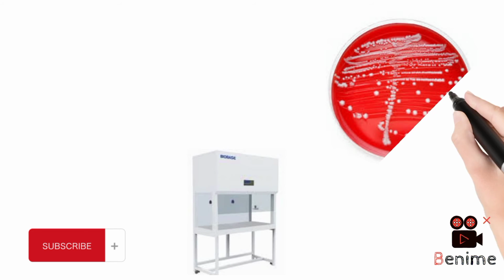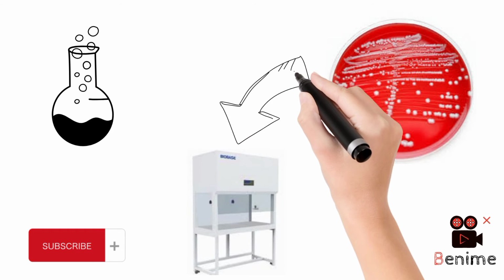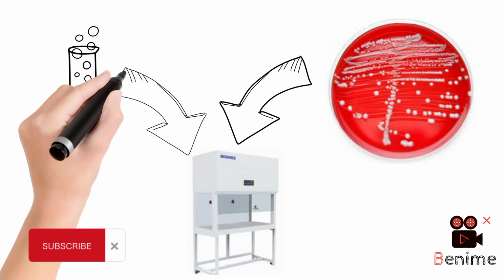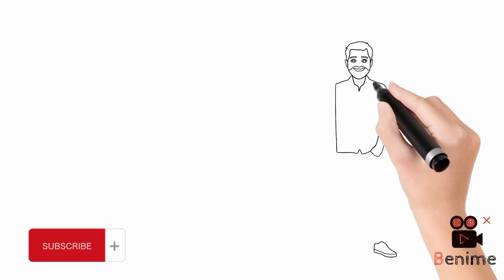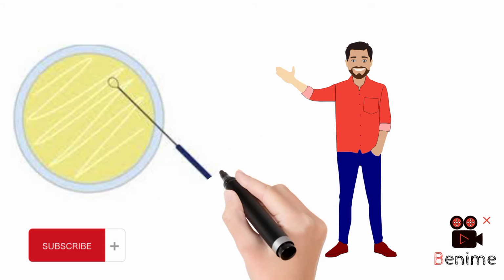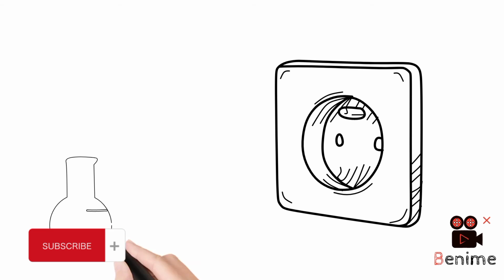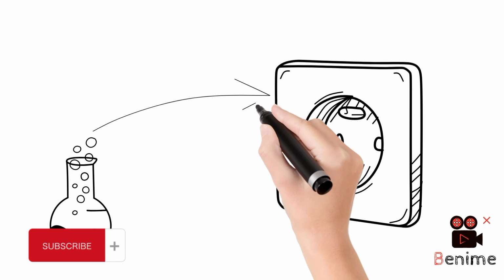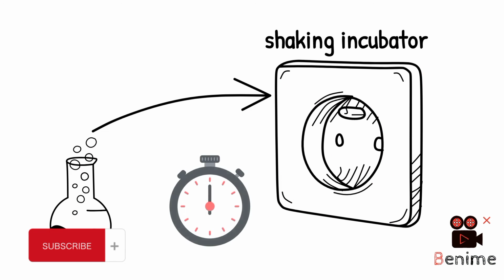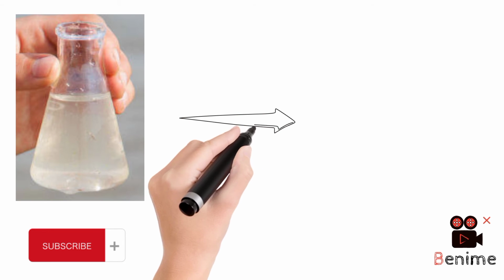Put the previously grown bacterial culture, both the petri dish and broth solution, in a laminar flow hood. It helps to protect the culture from dust and contamination. Then, we use the inoculation loop and place it on a flame until its tip becomes red hot. Pick a colony with this red-hot tip and dip it in the fresh broth solution. Then the broth is placed in a shaking incubator for 24 hours. After 24 hours, the solution turned yellowish from translucent, meaning the bacteria can grow in this solution. This is called turbidity. Now, we have a fresh bacterial culture.